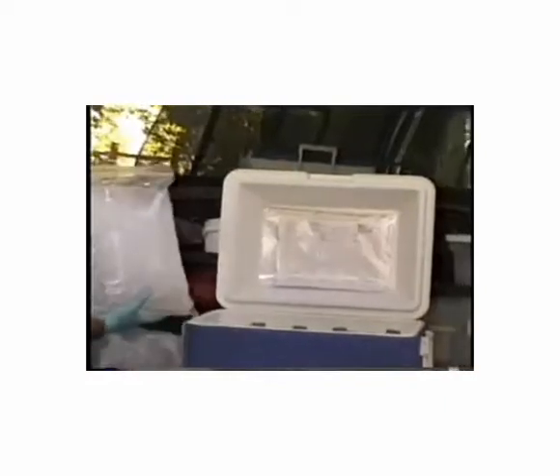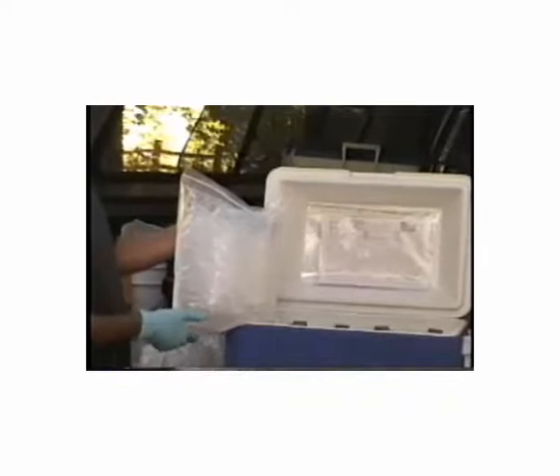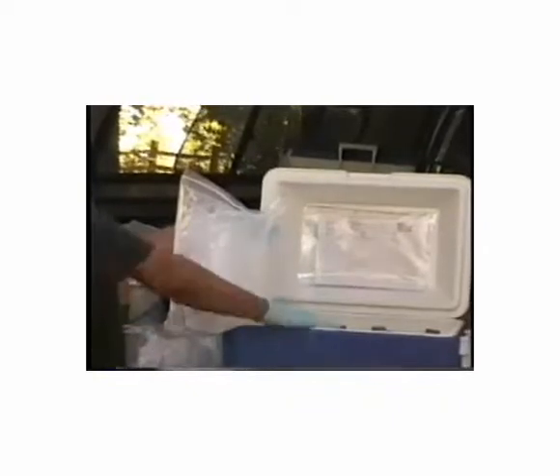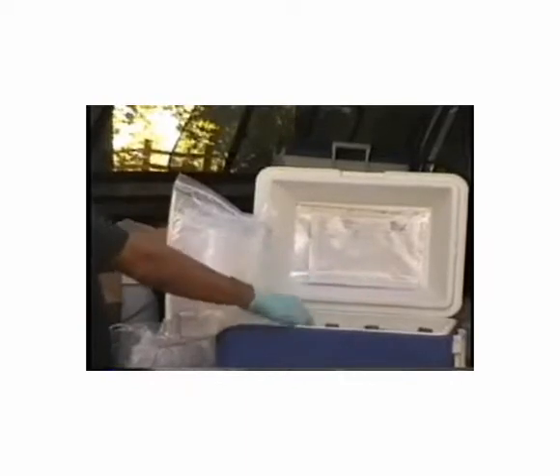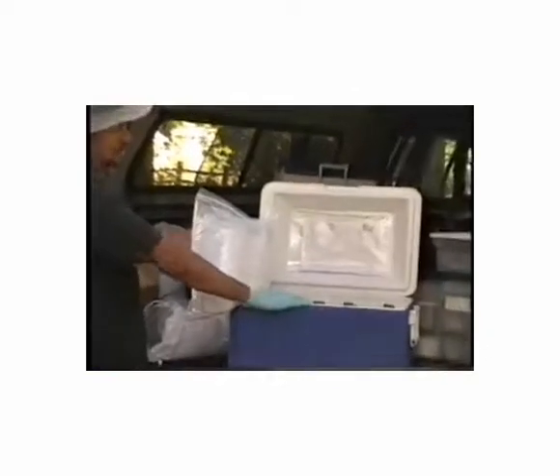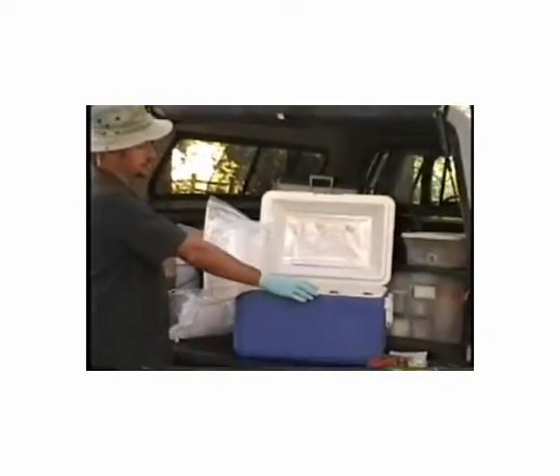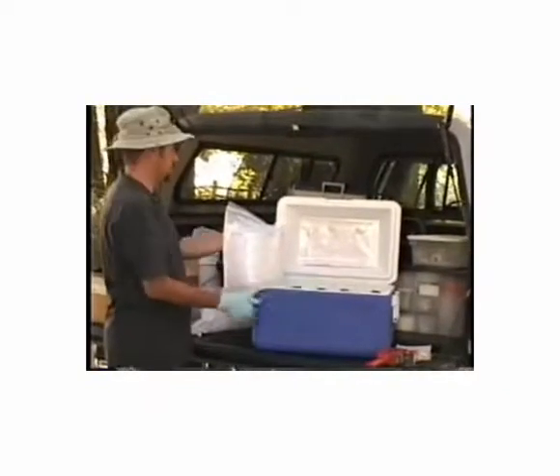We also want to make sure that all of the sample bottles are brought down to 4 degrees Celsius before putting them in the cooler. This ice sitting on top of these bottles is not enough to bring these bottles down to 4 degrees C. Therefore, it's always good to put your sample bottles in a separate cooler with ice before shipping.